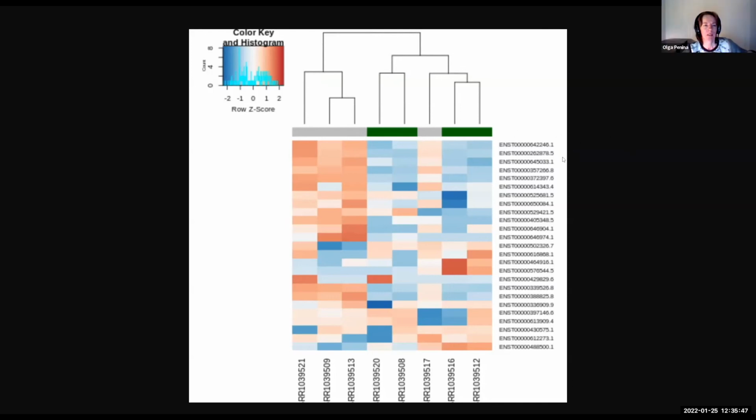So on the volcano plot, we decided that these red dots on the extremes of the horizontal axis, the genes that have the highest expression, or maybe the highest variability in something, but I can't understand what.